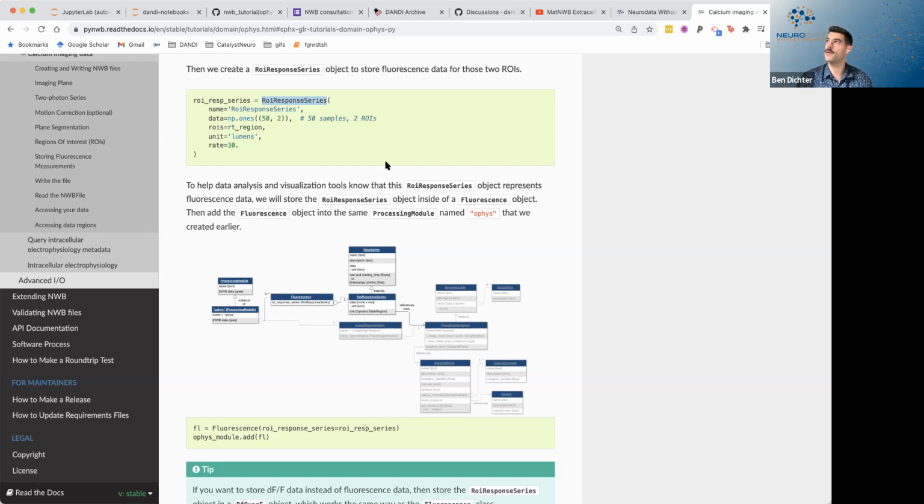One thing that I would distinguish is whether you're thinking about this in terms of an ROI that can exist across 2 planes or not. Sometimes the planes are so close together that you're really doing volumetric imaging and you're identifying ROIs in a volume.